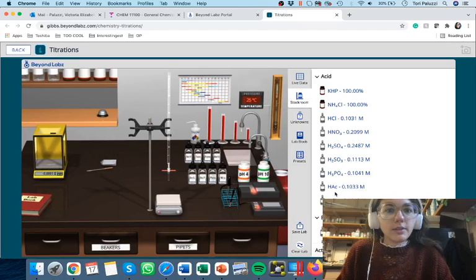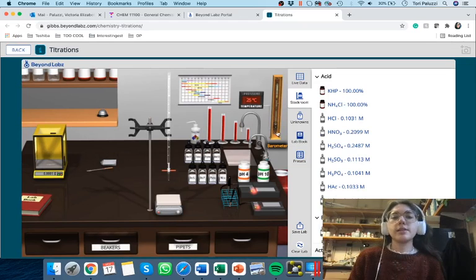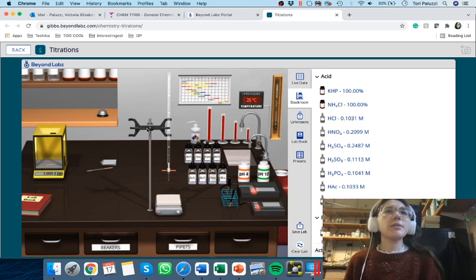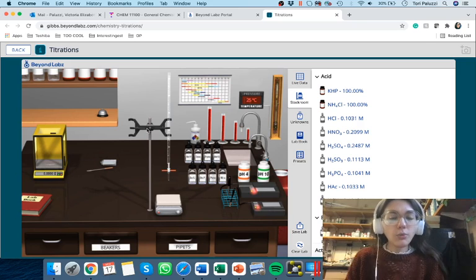All right, so the whole thing about Lab 11 is you guys are focusing on titrations, and from titrations we can find the unknown concentration of something that you're working with, which is super important when you say are taking a sample of something and you want to know, is it acidic, is it basic? These are ways to do that. So hopefully this lab is going to really cement in those things.